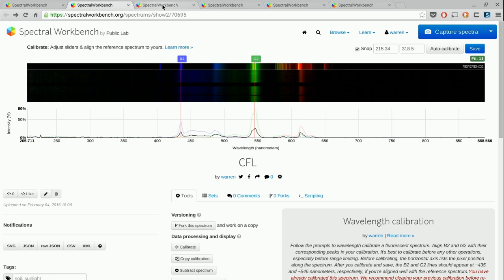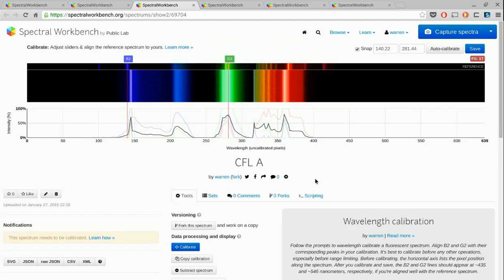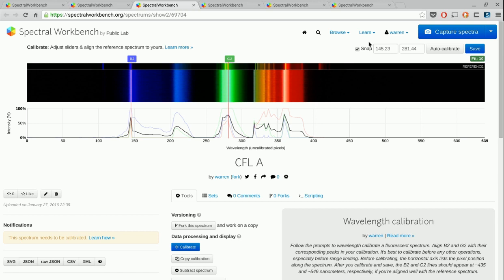Let's try it on a few different ones so you can see what that's like. Here, it's actually uncalibrated. So when I press calibration, we'll be doing it for the first time. And it runs an auto calibrate. It missed this peak, but it got this one. So what we can do is move this and it snaps and notice that the fit went down to 10. This one, I don't think we have to move, but we could just to show the fit will get worse and become red. And when we snap it over here, it looks good again.